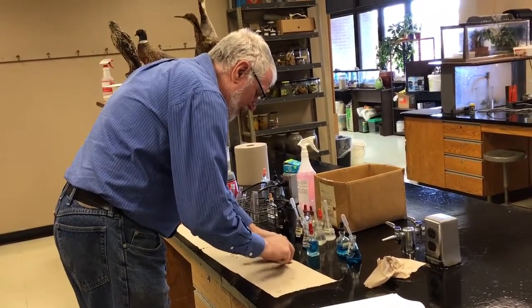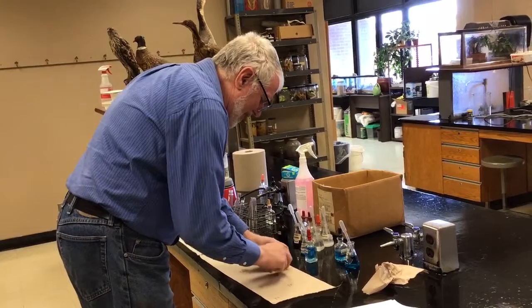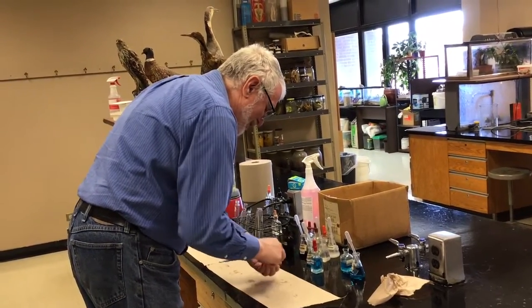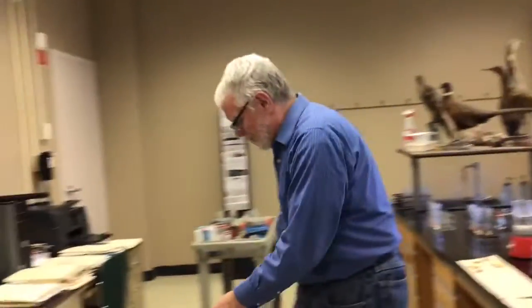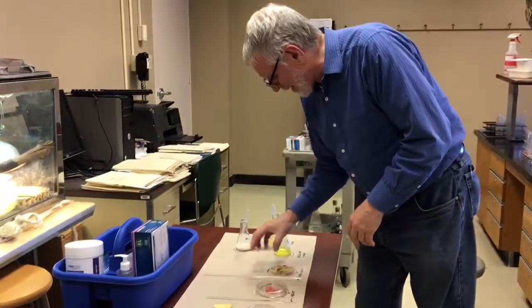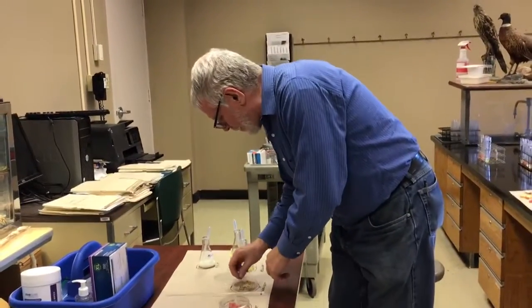I will tell you that having not run these tests in many, many years, I don't think I realized how important it is to crack the piece that you get, because after it's been sitting on the table for a while, it dries out. So doing this, I'm changing my instructions for my classes. Oh, I forgot, I need to put a piece of walnut over here.